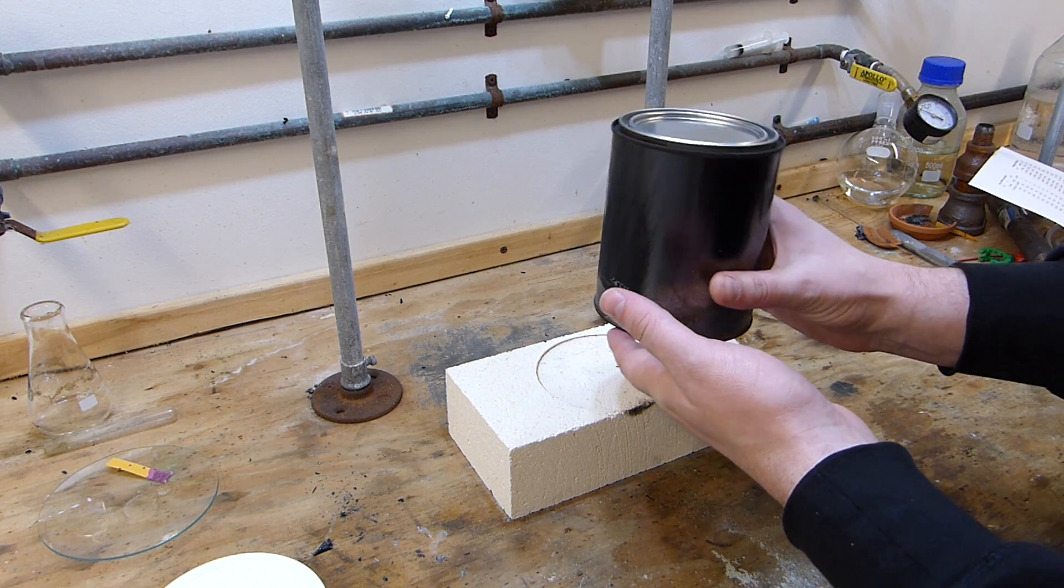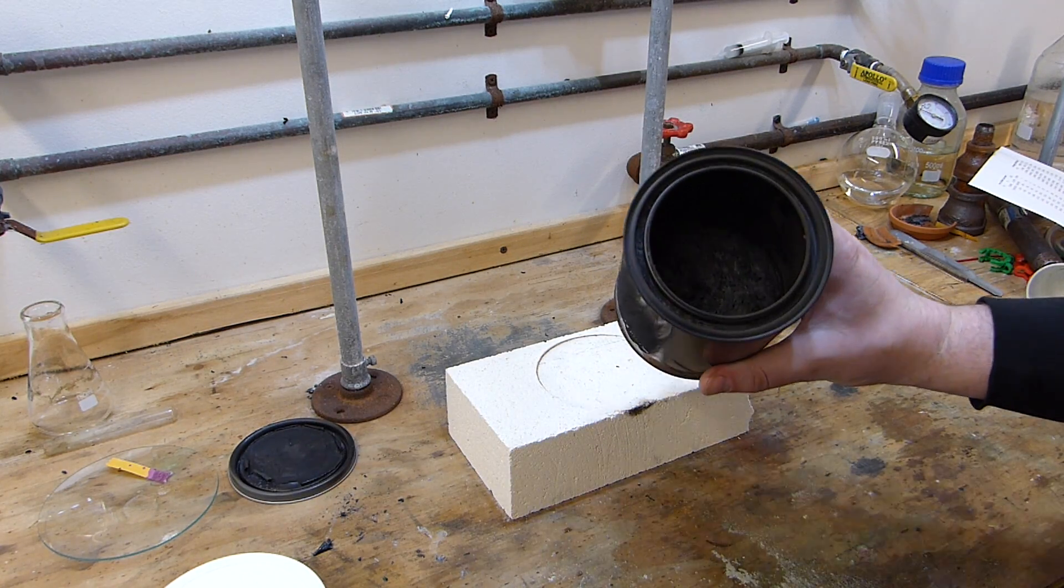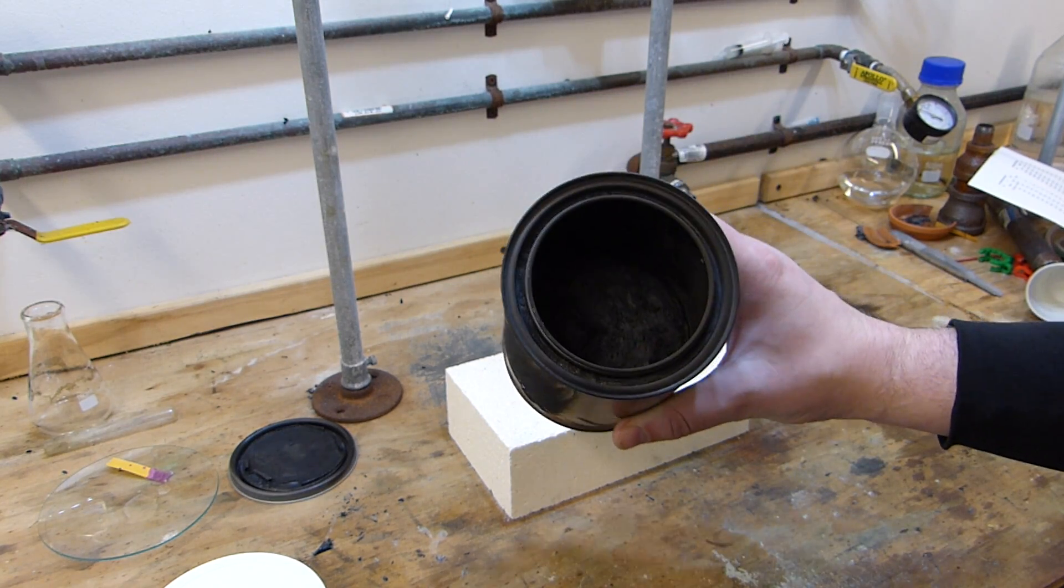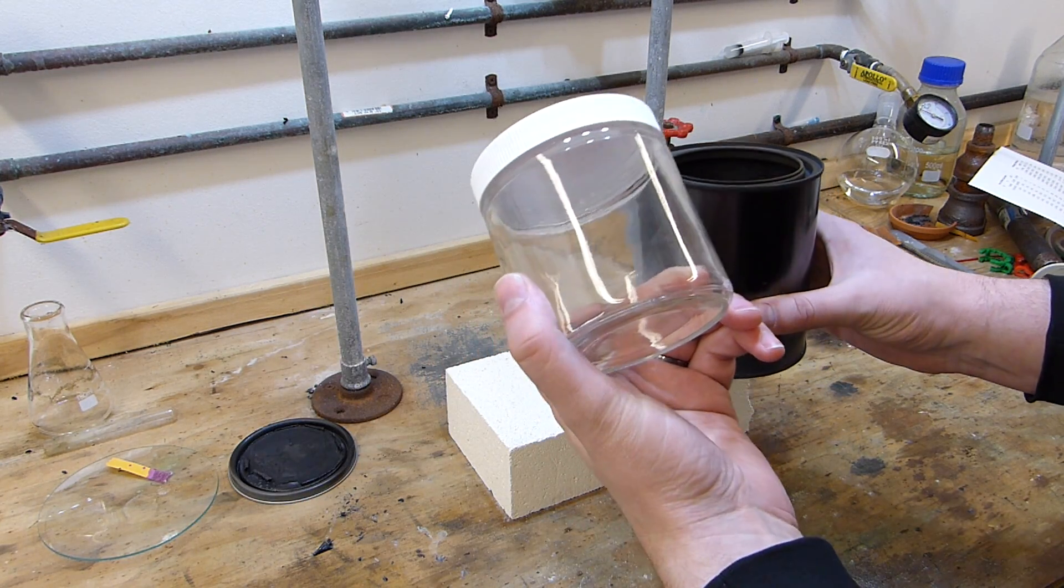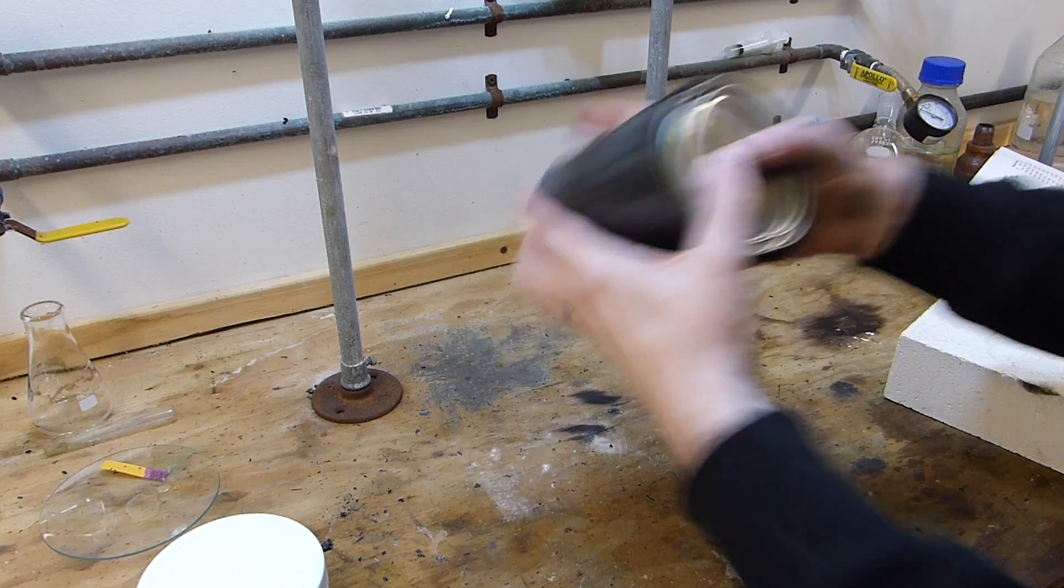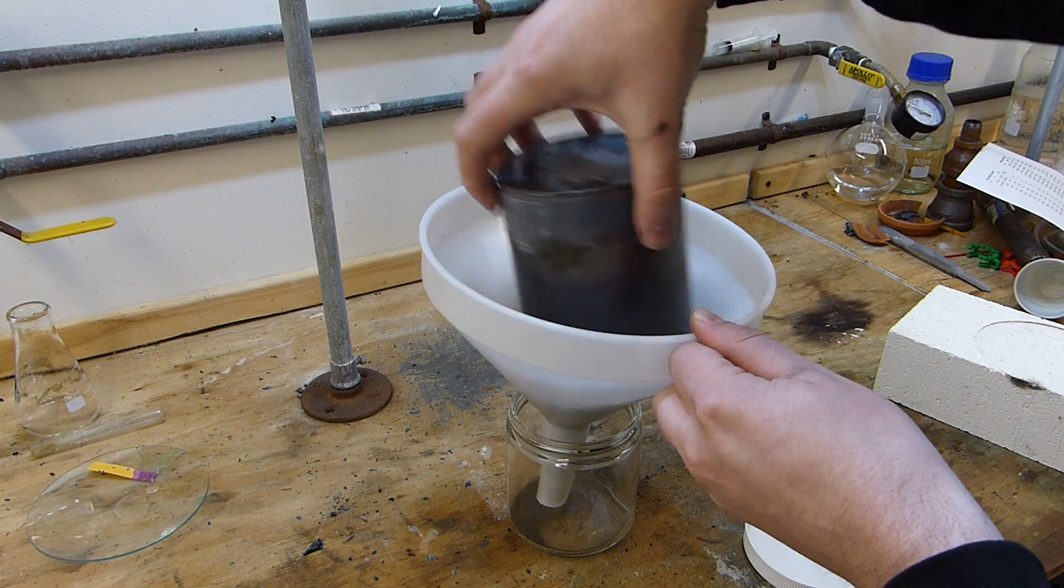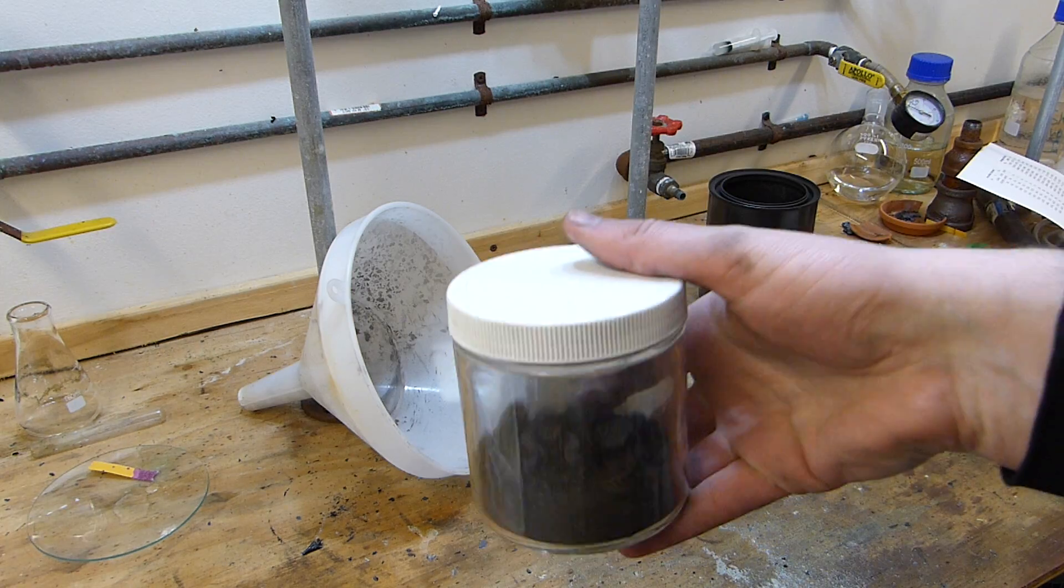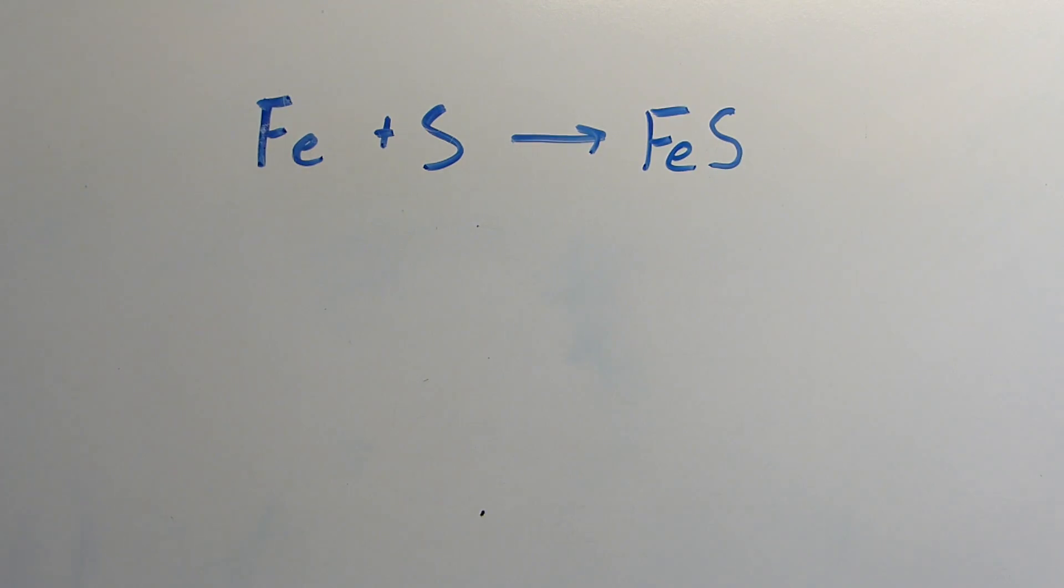Alright, so the can has now cooled almost completely. It's still just barely warm on the bottom, but certainly cool enough to touch. When I open it up, you can see inside, there's just a hard crust of iron sulfide that's pretty much a giant brick. So what I'm going to do is put the lid back on and shake the crap out of it again to pulverize it up and then store it in a jar. That's basically it. So there's our iron sulfide. I'll go ahead and label this.